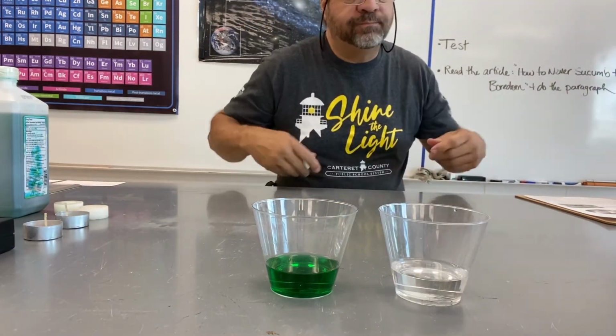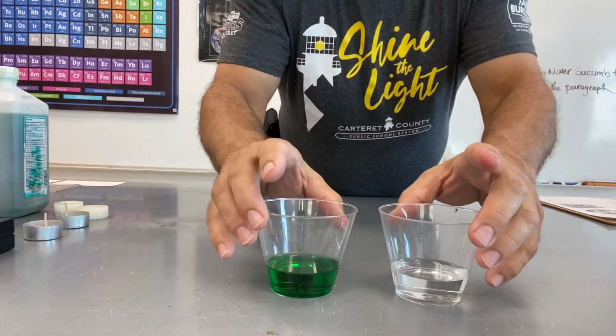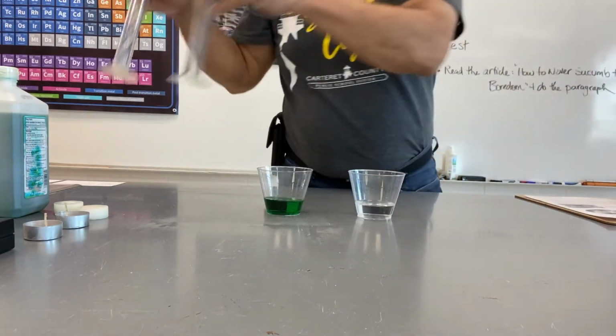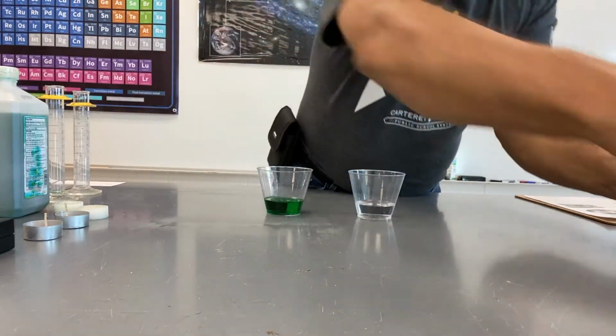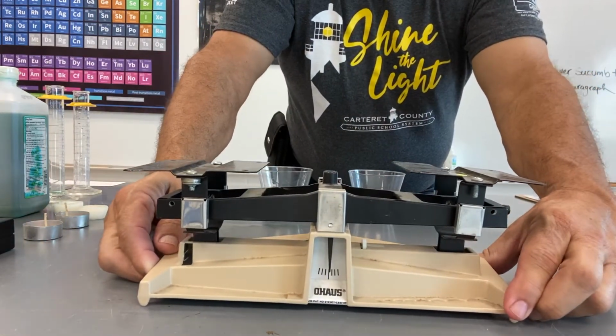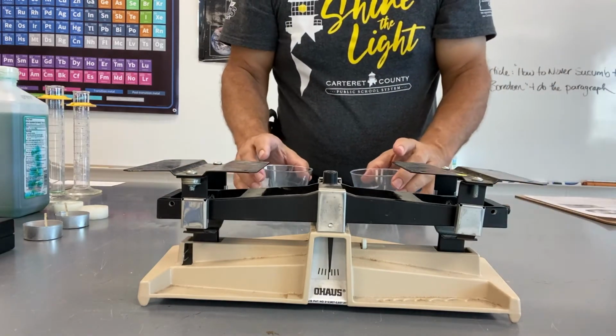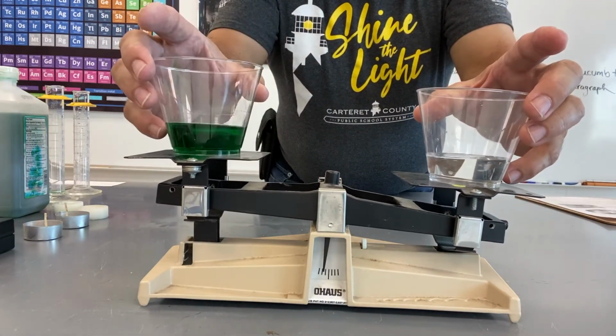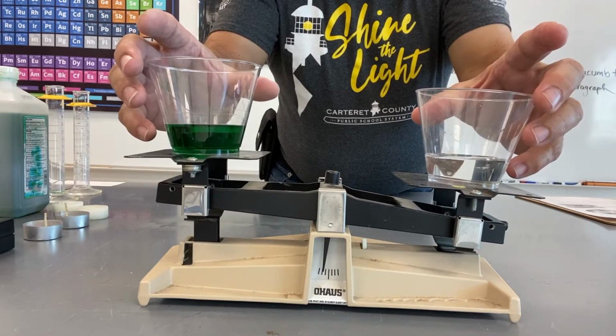Well, let's see. How can we test that? I'm going to move these back where you can still see them, so you know there's no hocus pocus going on. I'm going to bring out our balance here. Get that where you can see it. Here is our water and our alcohol on the balance. The cups are centered.